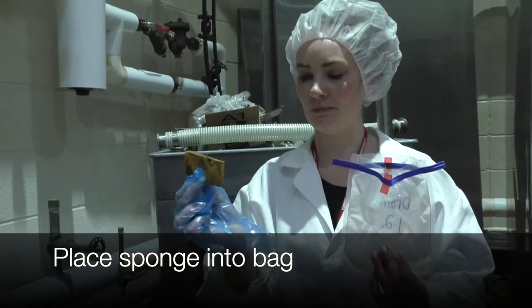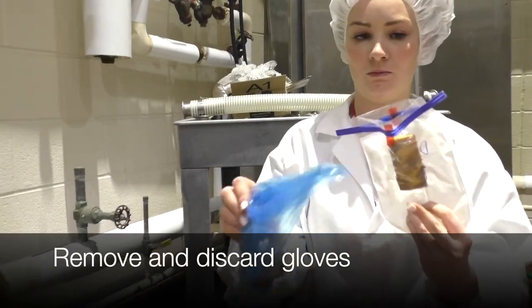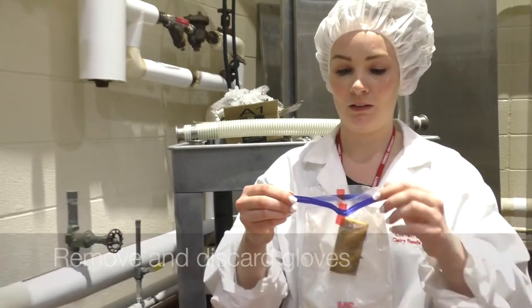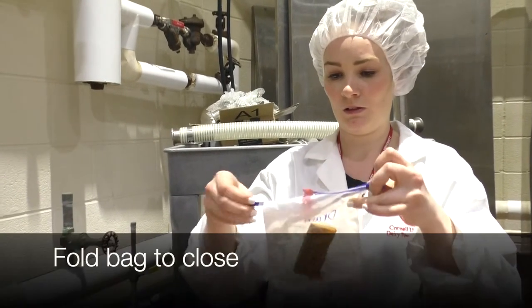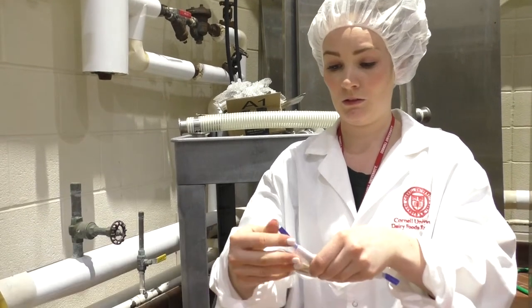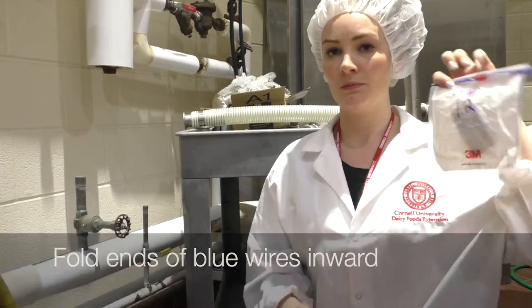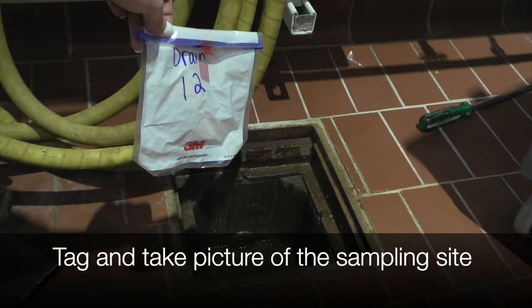Aseptically place the sponge back into the bag. Aseptically remove and discard your gloves. Fold the bag to close, remembering to not touch the opening or inside of the bag. Fold the ends of the blue wires inward. Label and take a picture of the sampling site.